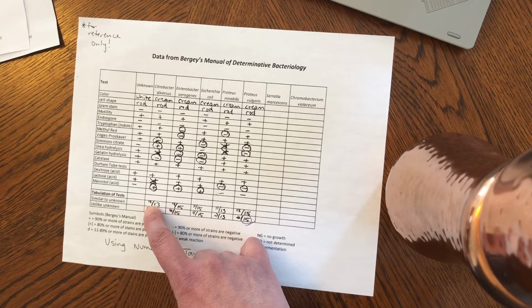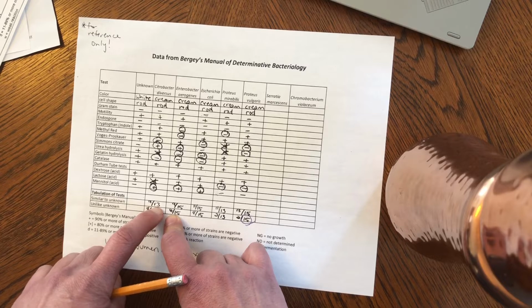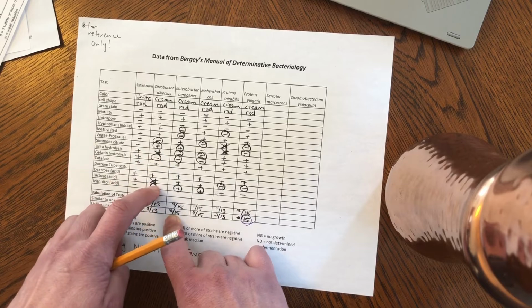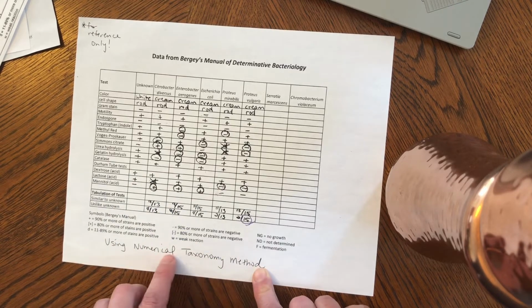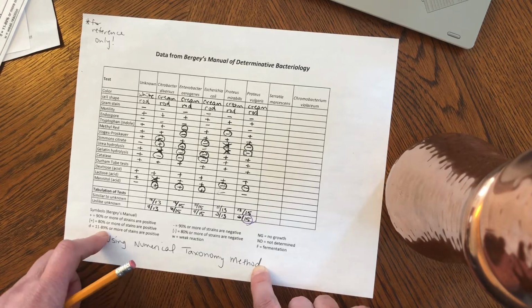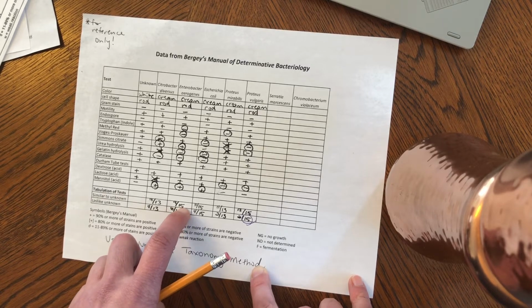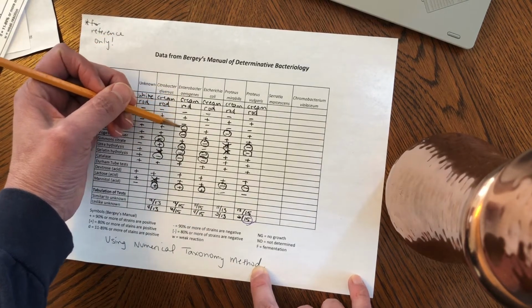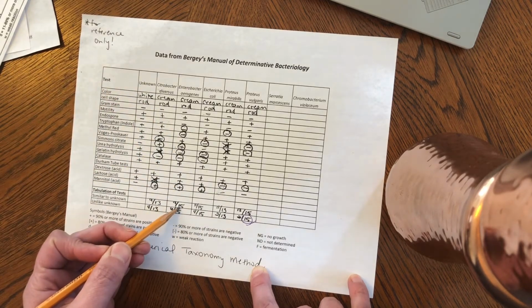So again, this 9 out of 13 is 9 matching test results to the 13 tests we can compare our unknown to. These D's that are crossed out are not tests that we even count. They were test results that were given in that Bergey's manual, but that D is such a funky, weird result that we can't really count it to match anything. So if we want to count how many test results we can compare with our unknown here, we get 15, because if you look, there's no D's. So we've got 1, 2, 3, 4, 5, 6, 7, 8, 9, 10, 11, 12, 13, 14, 15. 15 tests. That's why there's a 15 down there.